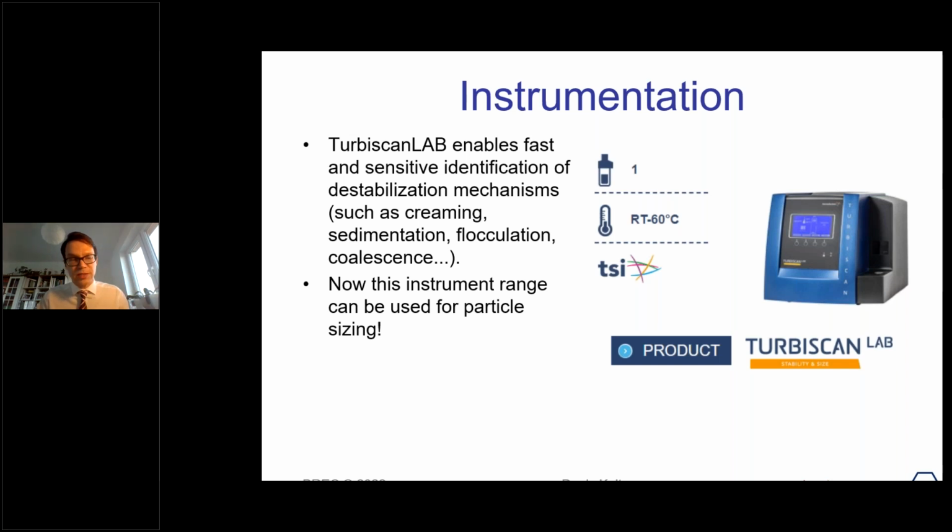Now, once you have particle size as well as stability, you have quite a good handle on what is happening in your dispersion. You can also find the mean particle size, then maybe do something to your sample, for example, sonicate it or put a dispersant in it, or add another component into it, and then measure the particle size again. And then it will give you a lot of quantitative information about what your samples do, because of all the procedures you're taking. So this is actually an interesting tool, and we are very glad to have worked with the Formulaction team, who were pretty much instrumental in bringing this document together.